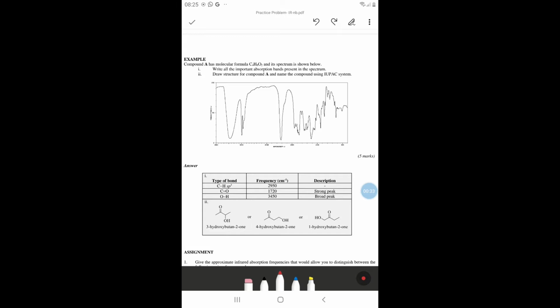So to come up with the structure of the compound, you need to identify peaks that correspond to the structure. When you look at the spectrum, first thing, as I mentioned earlier in the notes, you need to look around 1600 to 1800. So this is the scale, 1500, 2000. Around this region, if there is any intense peak, it belongs to carbonyl. So you have the intense peak here, so now you have a carbonyl.